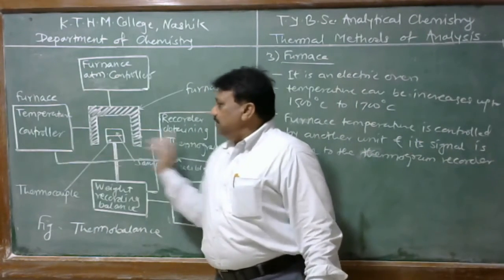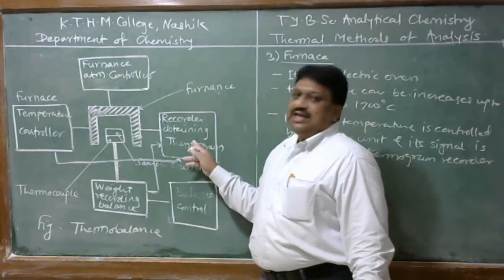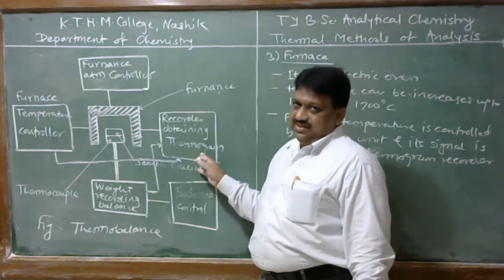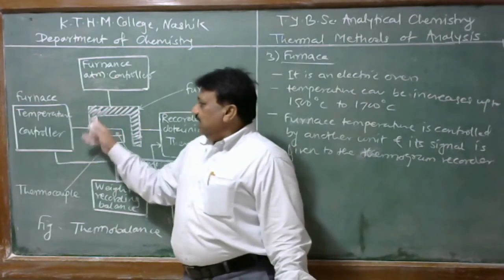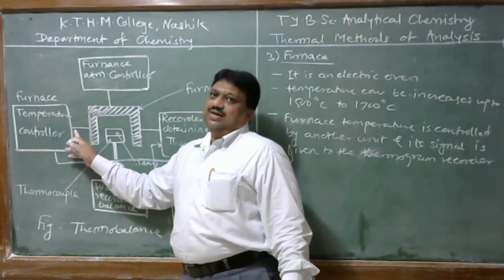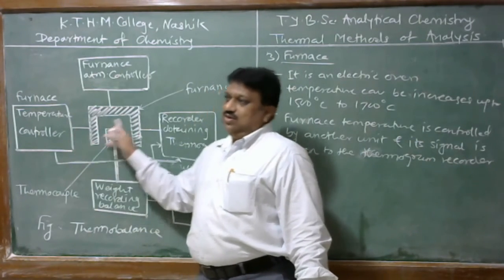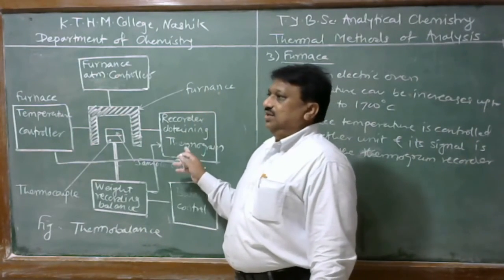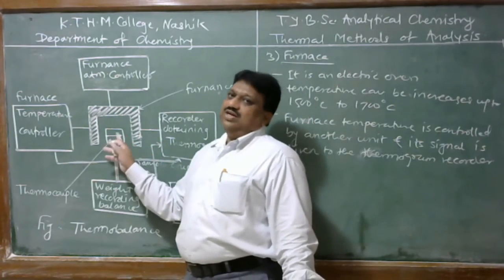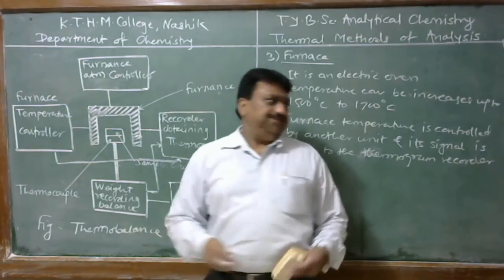Therefore, change in temperature and change in weight can be simultaneously recorded on the thermogram for that material. This is the heart of the thermobalance, the weighing balance and the furnace temperature controller, the most important components.